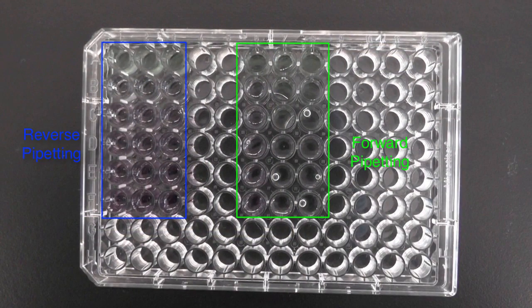Here is the side-by-side comparison of how the 96 well microplate looks with reverse pipetting and forwards pipetting. As can be seen, forward pipetting is more likely to create bubbles if the liquid is not carefully expelled.